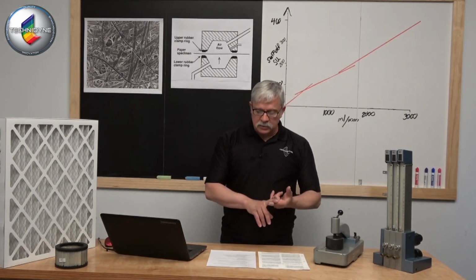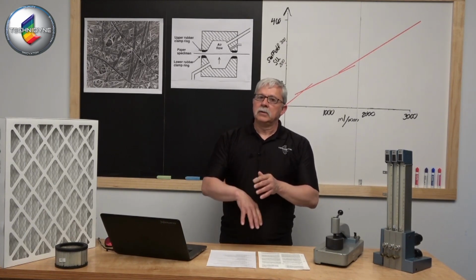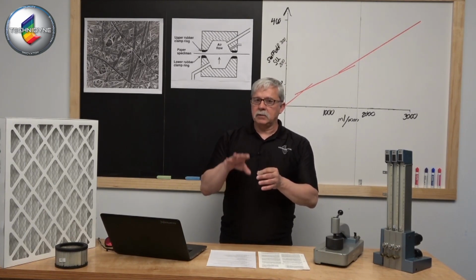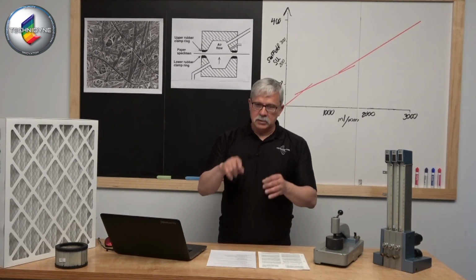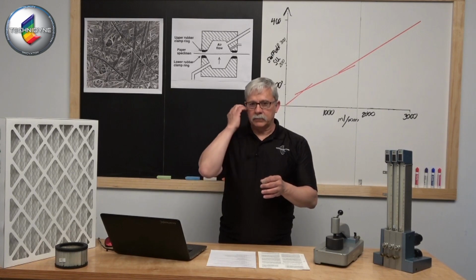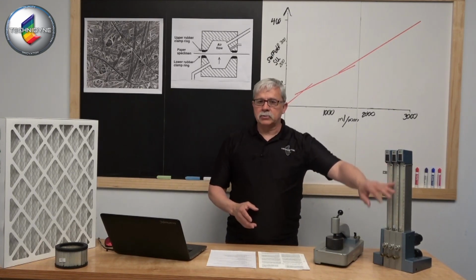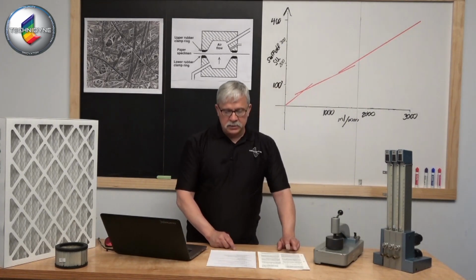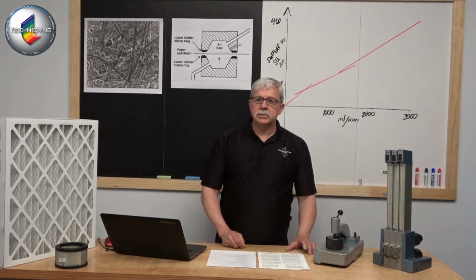So they have a 3/8 inch orifice that can be used. You neck that down, you maintain that same pressure differential, which is 1.5 psi between one side and the other of the sheet, and now you get a little lower airflow, and you can actually measure it with your measurement system. The same thing occurs on the tighter side.